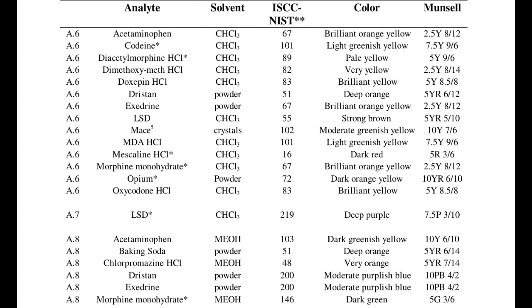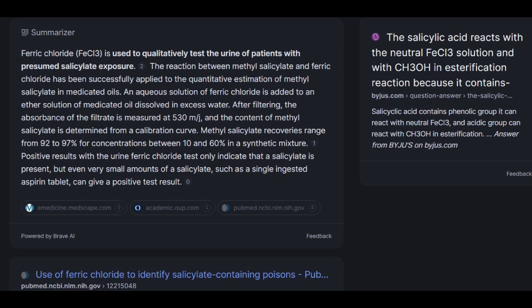This reagent test isn't used for many drugs. In fact, it finds its greatest utility in detecting phenols. According to Wikipedia, it's also used in a clinical sense to test for phenylketonuria and for salicylates in the urine. I was able to find some supplemental material that confirmed the salicylate one, but I don't know. There were no sources given on the Wikipedia article. And phenylketonuria gives me flashbacks to biochem class, and so I didn't want to look at it.